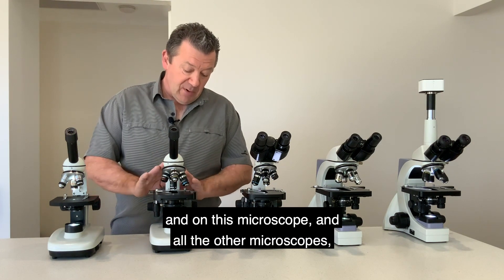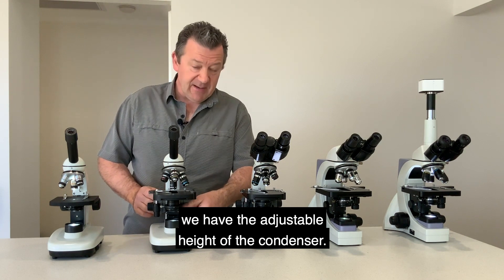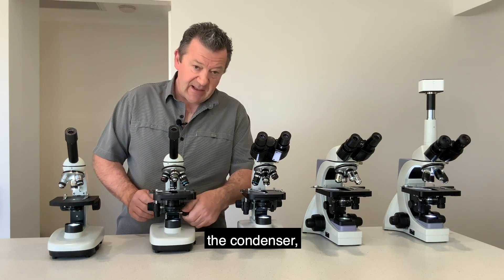On this microscope and all the other microscopes we have the adjustable height of the condenser, so we can easily adjust the height of the condenser.